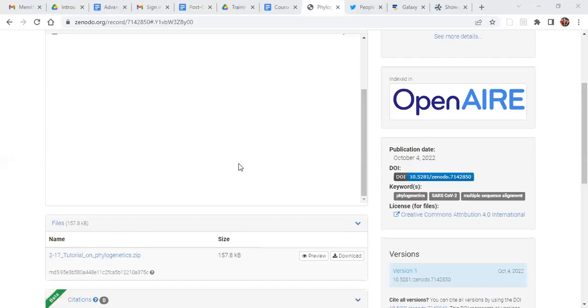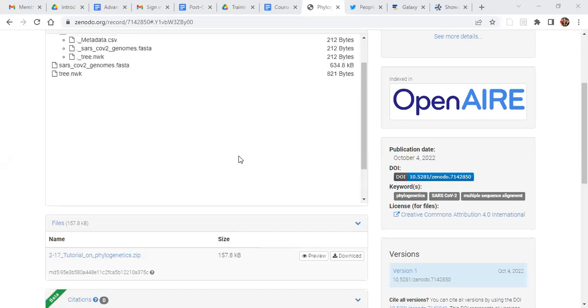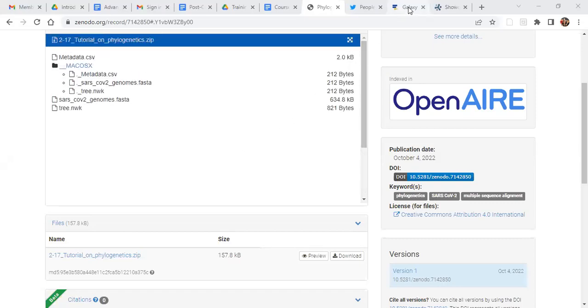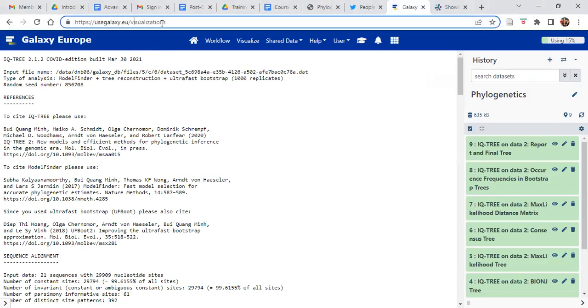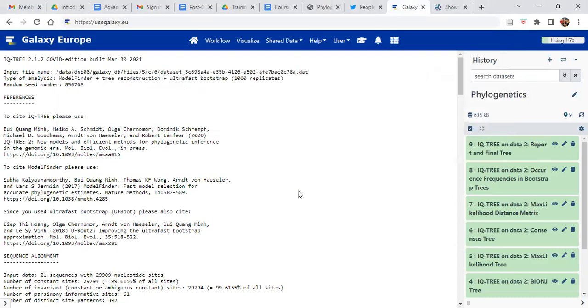Let's go back to the other screen. You've downloaded that file and we're going to use it in the next step. Log on to usegalaxy.eu. You should have by now worked through some of the tutorials that showed you how to navigate Galaxy. You should have had an introductory course. If not, please start with that first because we won't be able to go through all of that in this video.